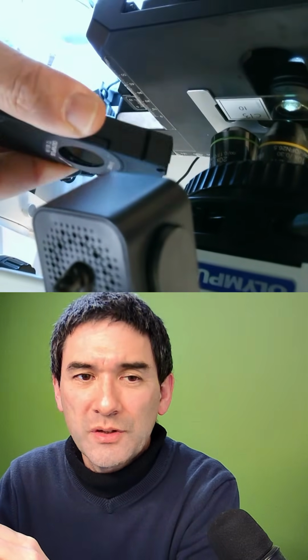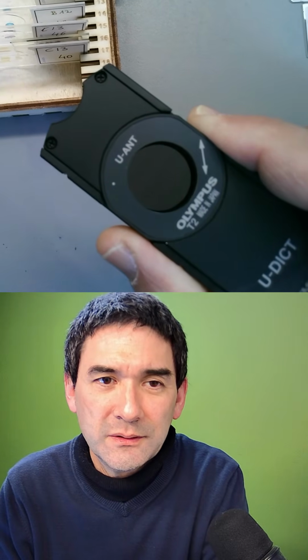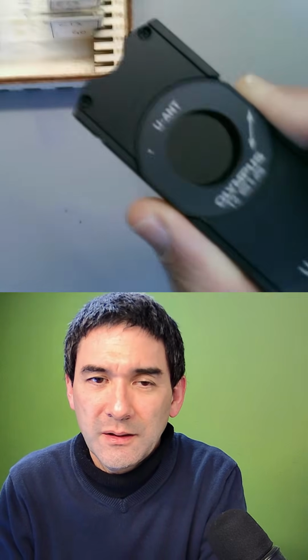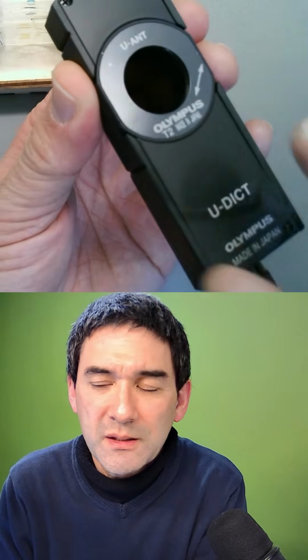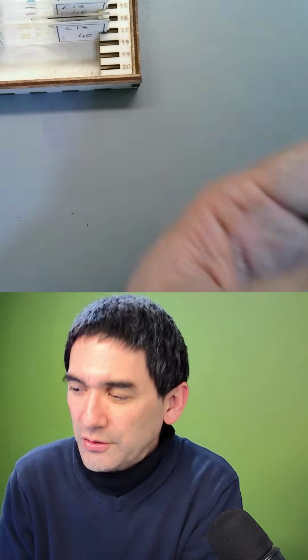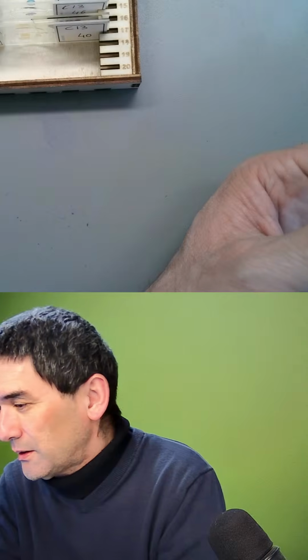If you are interested, I can take it out and show it to you. It's called the Wollaston prism. And by turning this here, I'm shifting something, and then this is able to change the colors. So how do I get it back? In case you were wondering how this actually works.